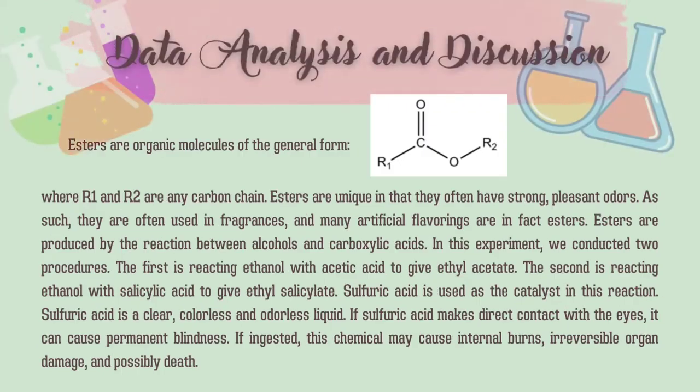Esters are organic molecules of the general form below, where R1 and R2 are any carbon chain. Esters are unique in that they often have strong and pleasant odors. As such, they are often used in fragrance, and many artificial flavorings are in fact esters. Esters are produced by the reaction between alcohol and carboxylic acid.